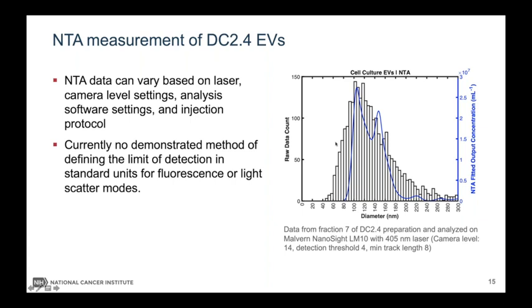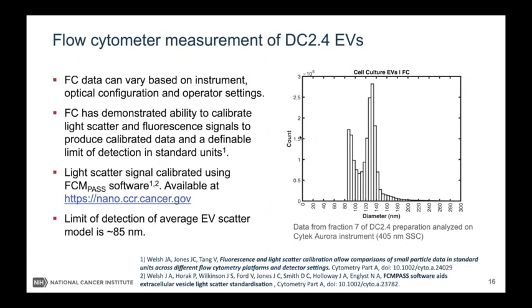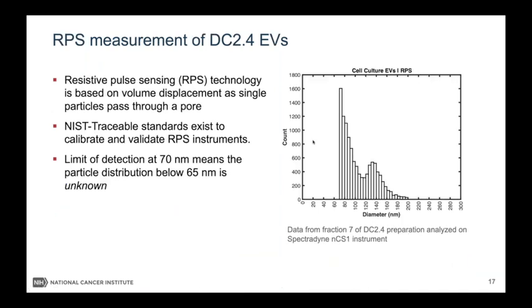So this was the kind of diameter distribution that we were used to with the NTA. As we moved more recently to a flow cytometer with an APD, we got this really nice tight CV population that we saw on our Astrios and in our early assay development, but we also saw this tail start to develop. This diameter has been produced using light scatter modeling, and flow cytometry light scatter modeling isn't a perfect technique for producing diameter distributions. You do have to make assumptions, but it's very clear that there was something else going on at this lower population. Then as we first tested the Spectradyne instrument, we were even more surprised to see that this population just kept on increasing. The population we'd been defining for a number of years, and thought was the whole population with NTA and our lower sensitivity flow cytometer, actually turned out to be the minority.